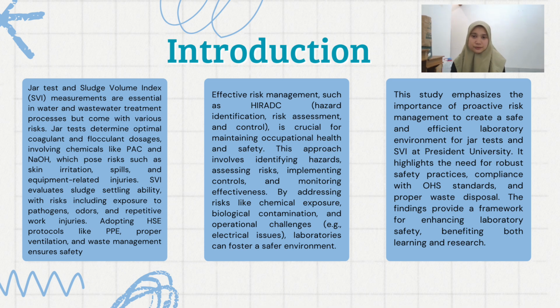Jar test and sludge volume index, or SVI, measurements are essential in water and wastewater treatment processes, but come with various risks. Jar tests determine optimal coagulant and flocculant dosage, including chemicals like PAC and NaOH, which pose risks such as skin irritation, spills, and equipment-related injuries.